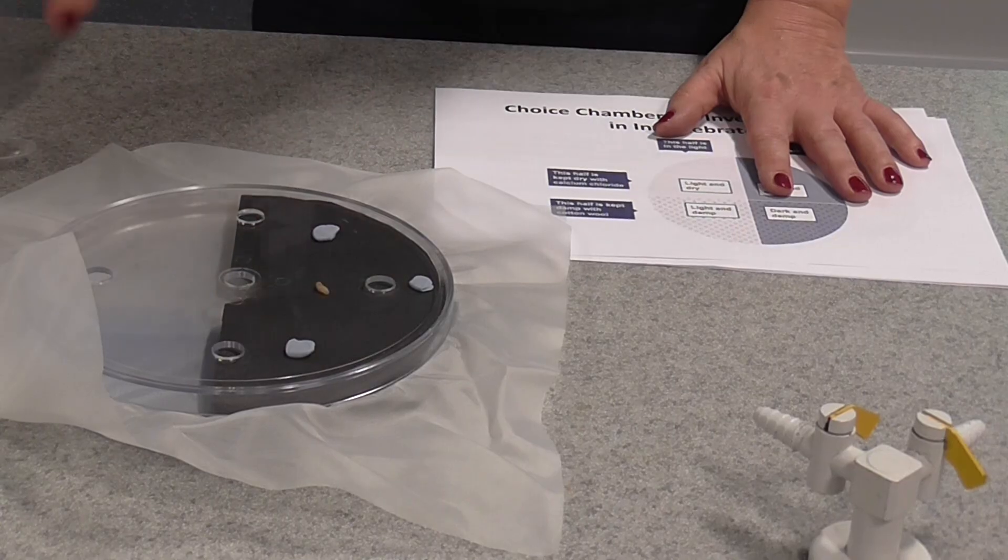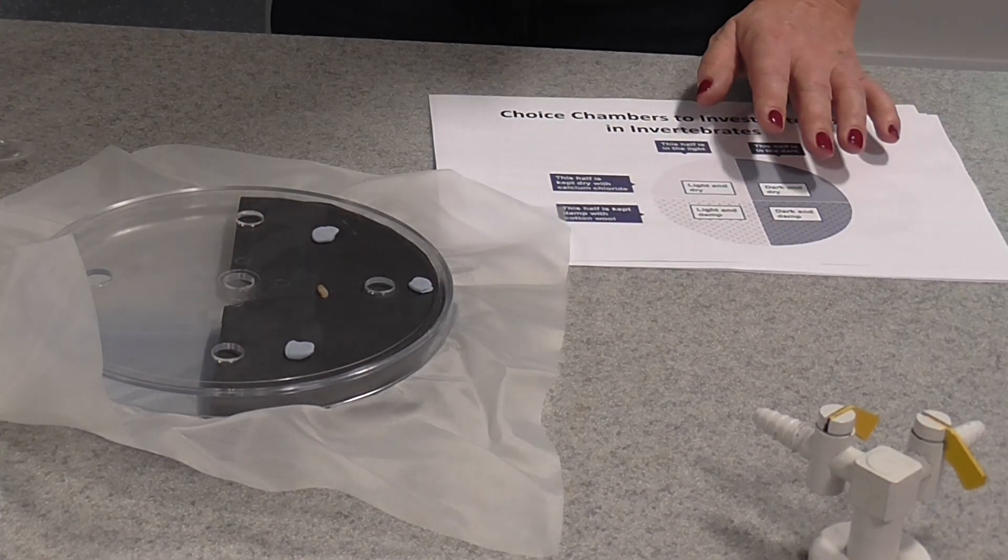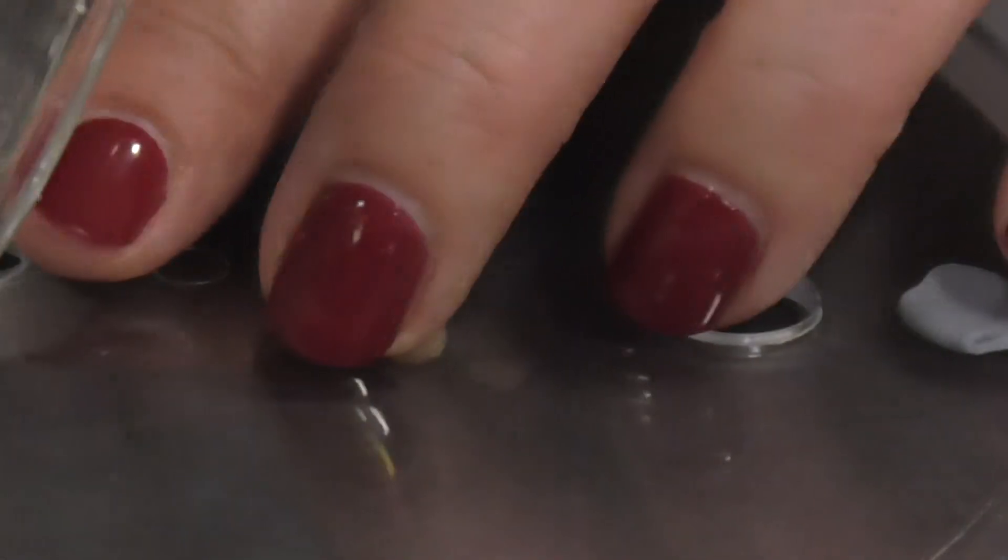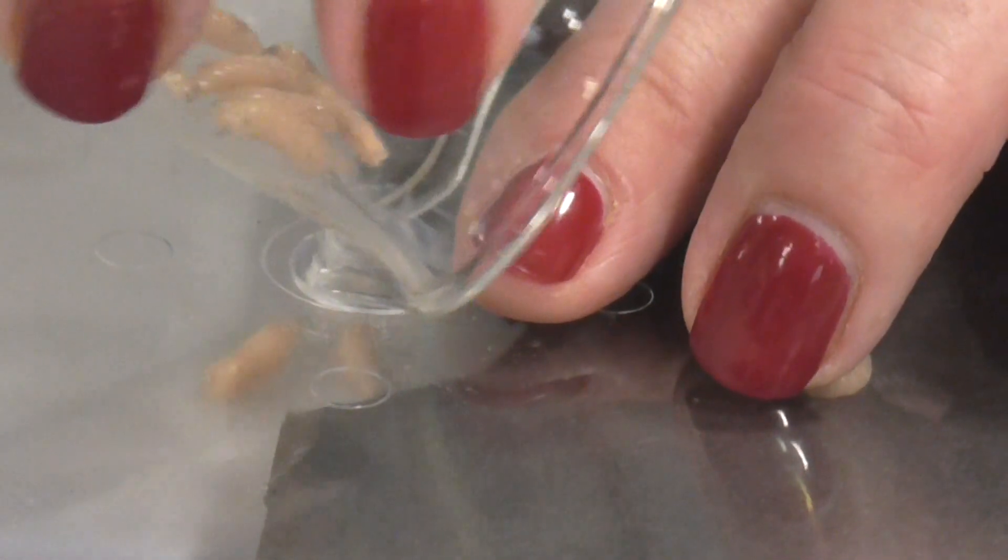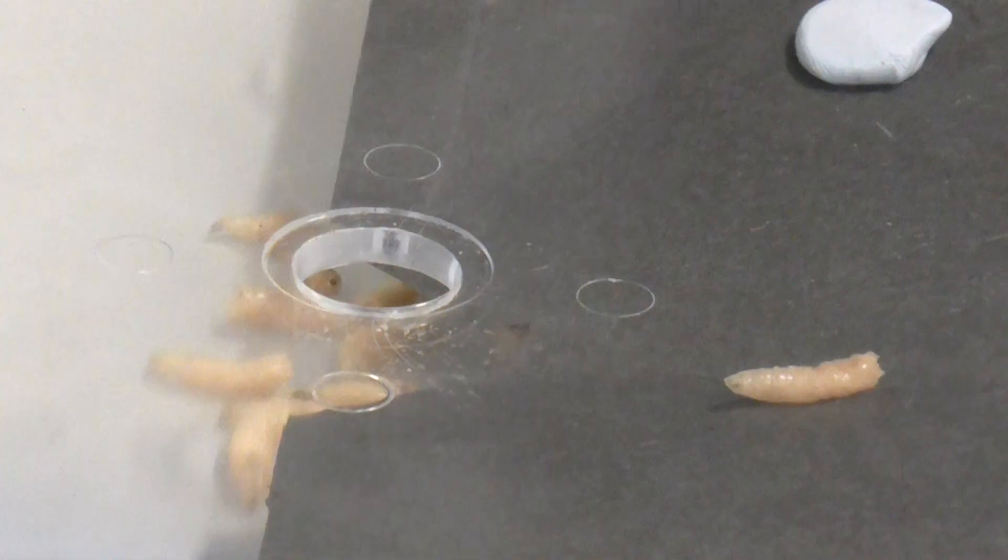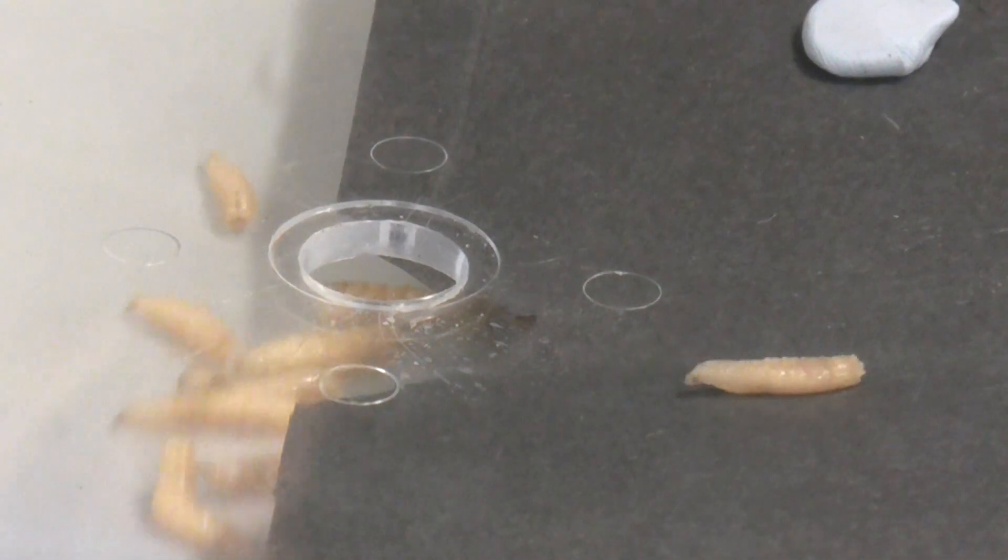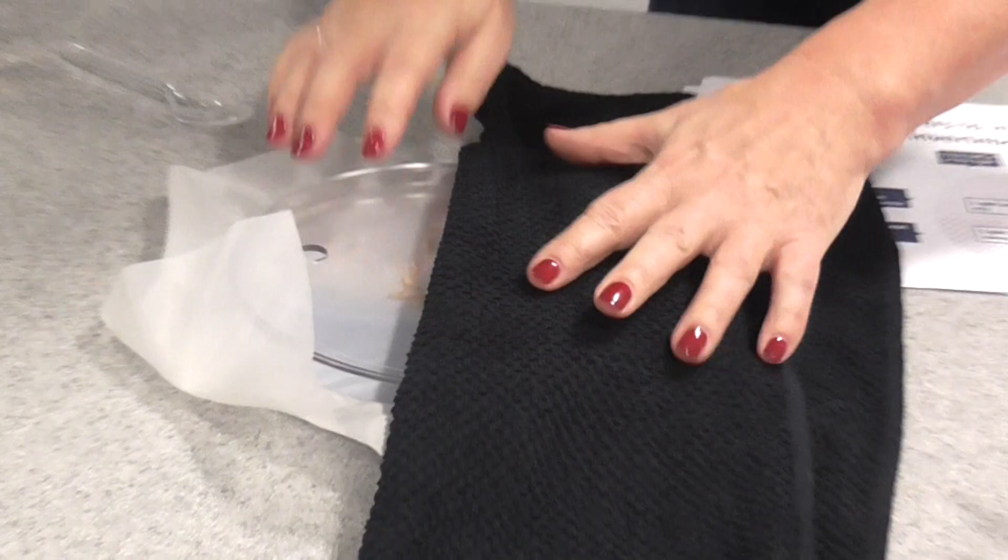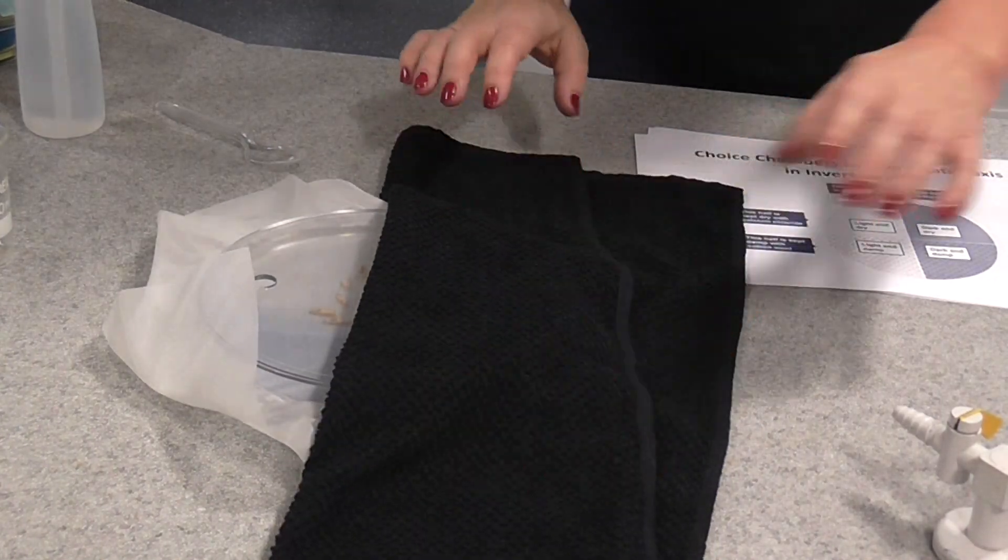Now then, the next thing we're going to do, we're going to place 20 maggots or wood lice into the central little hole there into the choice chamber. Just to make sure that the dark sections are in darkness here, I'm going to cover half of it with a dark cloth like that to keep the light out.